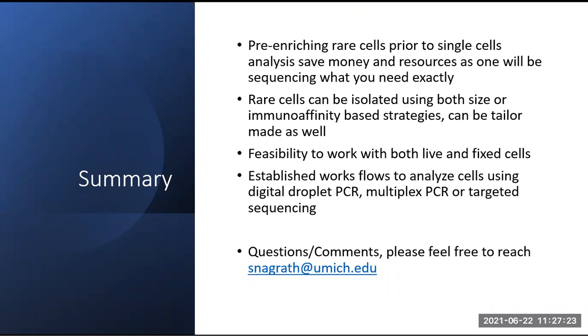And then we can do downstream analysis that includes either a targeted PCR using the digital droplet PCR, which has a single molecule resolution, or you can do a multiplex PCR for multiple genes at the same time, or a targeted sequencing like I have shown with the DEPArray.